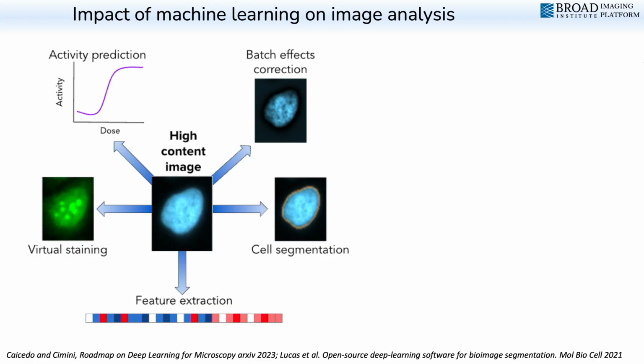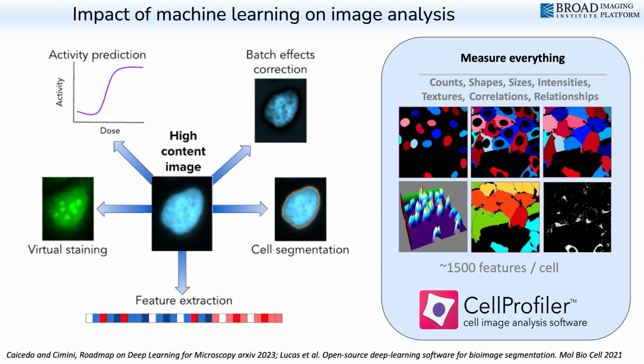And it's now possible for us to identify cells in an image, extract measurements from them, and then correct for technical artifacts far more effectively thanks to these advancements that have percolated into our field. Many of these advancements have made their way into bioimage analysis tools produced by the community, including, for example, CellProfiler, developed by our lab, which is one of the workhorses for bioimage analysis in the field. And then there are many, many other such tools.